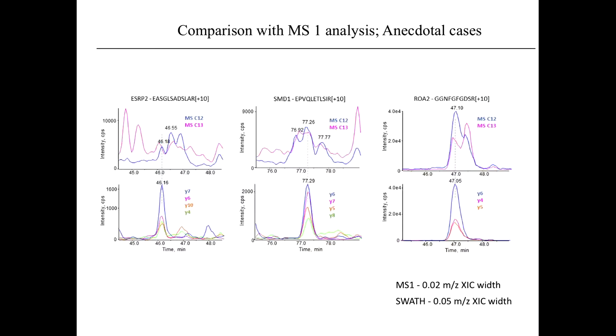And we see clearly that the MS1 level gets fairly noisy. Through filtering out of noise, by the fact that we look at the fragment ions and not the precursor, noise is reduced, and we see very nice transition groups for this particular peptide, whereas the precursor ion of this peptide would be already in the noise and could not be quantified. Same here, and same here.